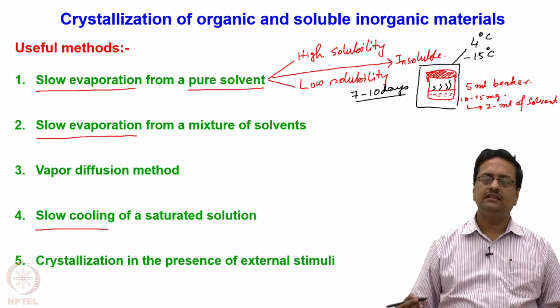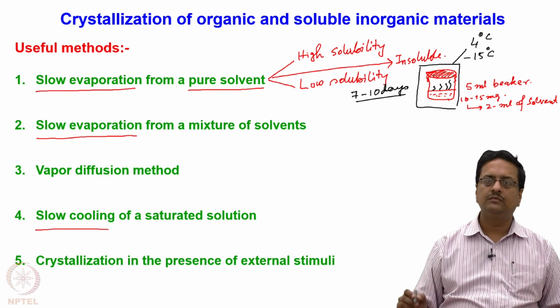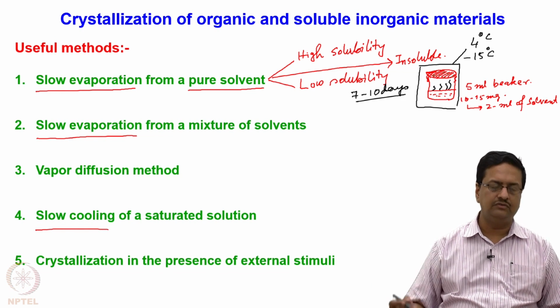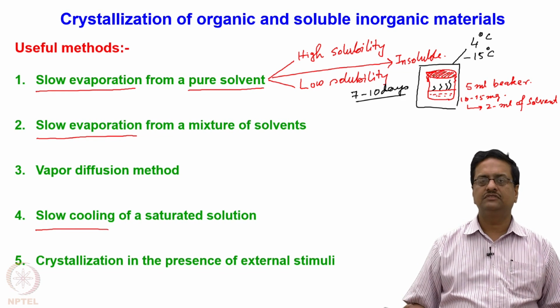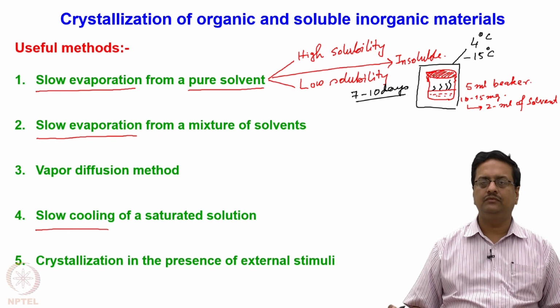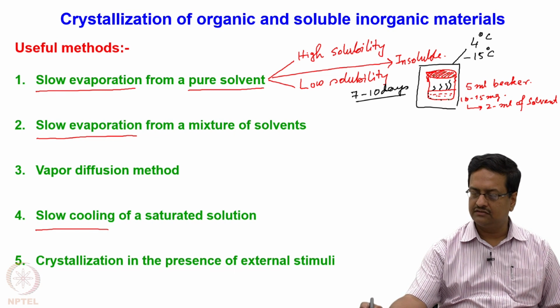With slow evaporation of the solvent, at a given point of time the solution reaches saturation with the compound, and then the compound slowly comes out of the solvent, the nuclei start to grow, and at the end of the day, maybe after a week or so, we end up getting crystals of the compound sticking on the walls.